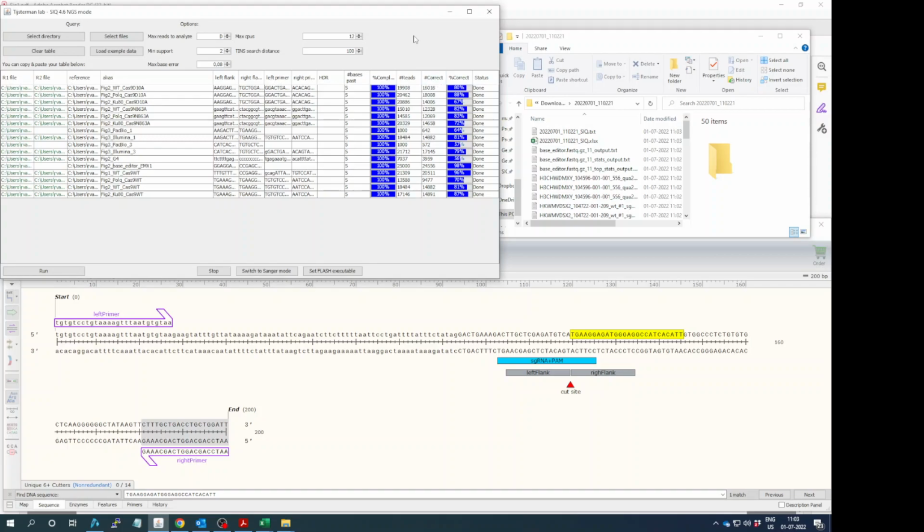Okay, that ends this tutorial, and if you have any problems or whatsoever, don't forget to put them in the GitHub issues tab so we can help you further with it. In the next tutorial we'll discuss how you can now use this Excel file, which is the main output of SIQ, to explore your mutational profiles and to make sense of your data. Hope to see you there.